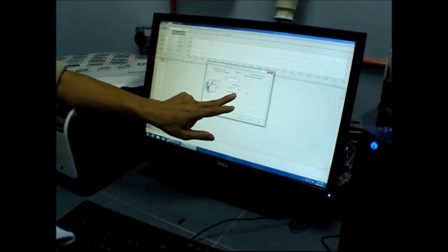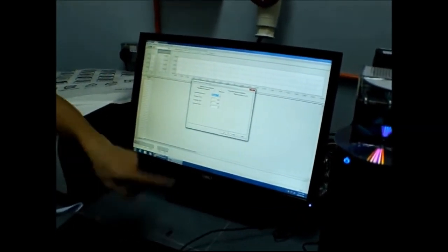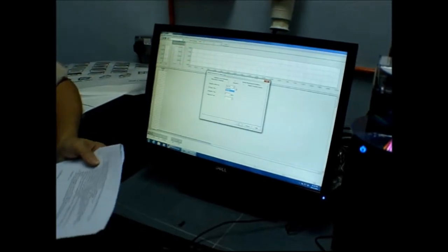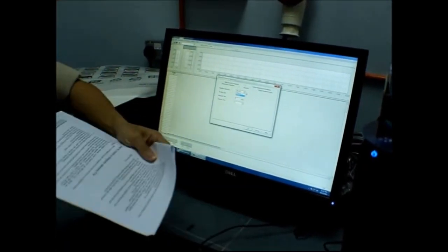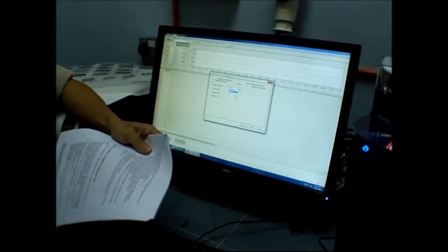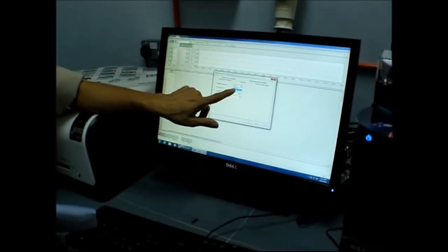No problem. Okay, next. Click the measurement parameter here. You select SMMM. SM means sampling, measure. Save your time. Sampling, measure. Otherwise you are wasting your time, so sampling, measure is easier. So you check this one, select this one.